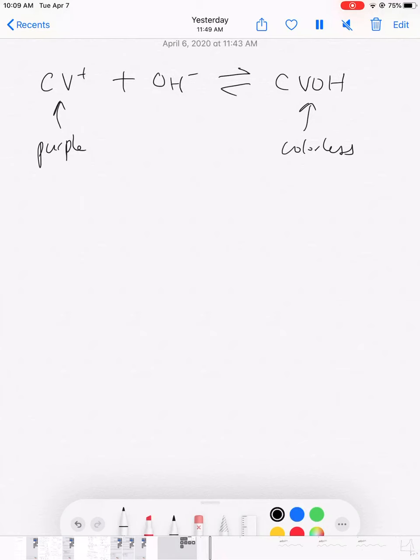There's a way you can quantitatively measure color, and that's using a spectrophotometer, using spectroscopy. Spectroscopy is just a way that you can quantitatively measure color. I don't know why nothing is coming up. But you can quantitatively measure color, and color has different wavelengths.